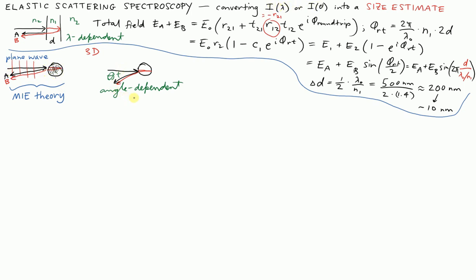And in this particular class, I will come right out and say we don't calculate this ourselves. There are a lot of calculation engines out there, and our book has information about it. The point is that this is a solvable problem. The rest of this tutorial is about figuring out what do you do once you've got access to this theory. How can you make measurements that you can compare to theory and that extract the size of something. And there are two different things that we're going to encounter in this game.